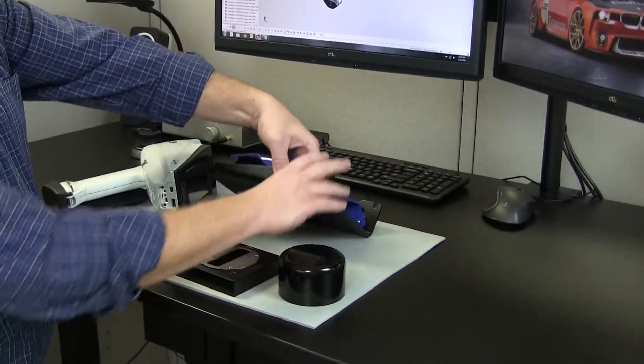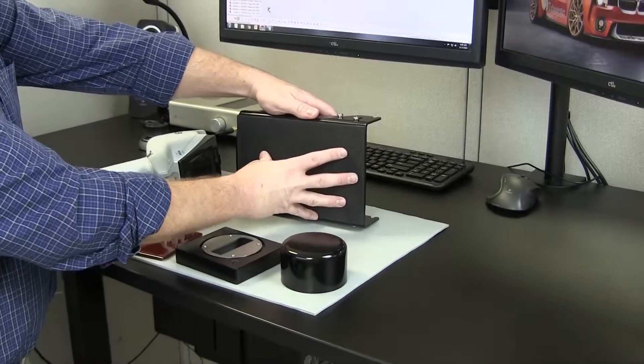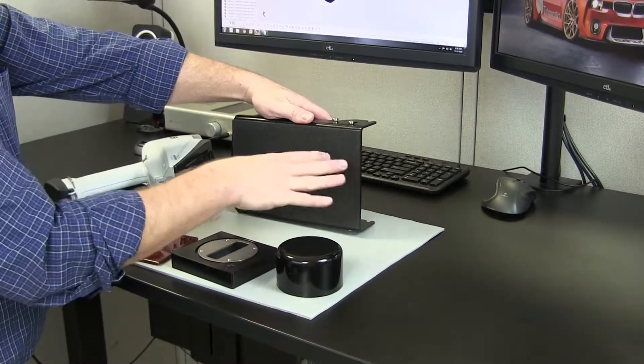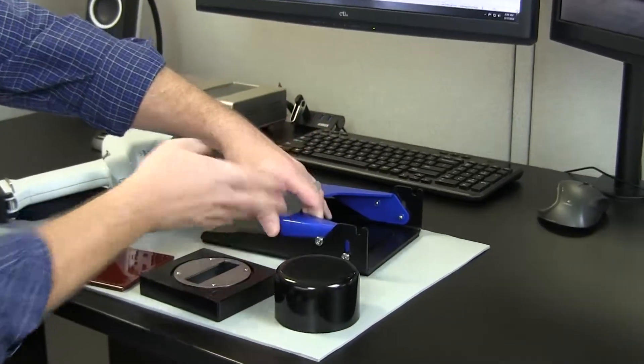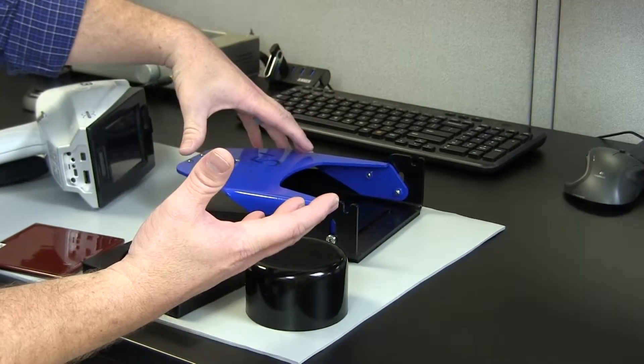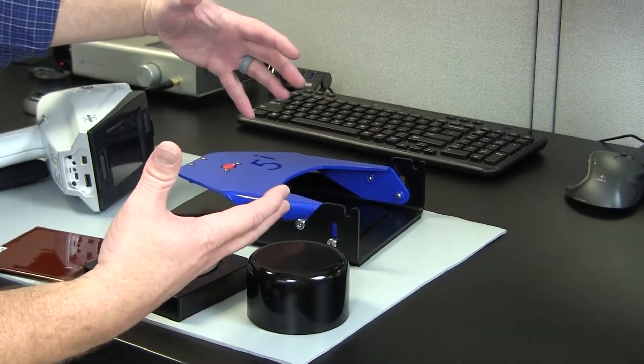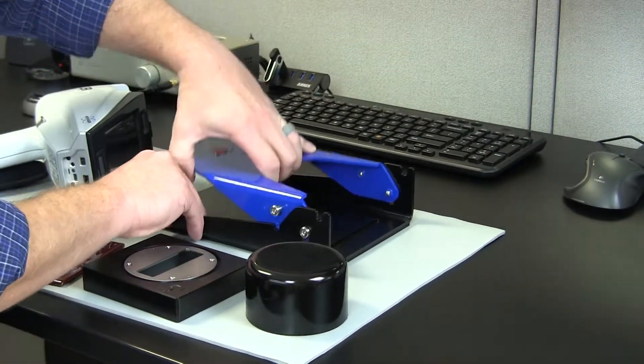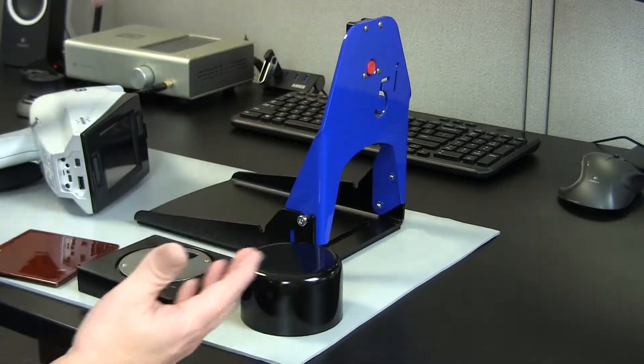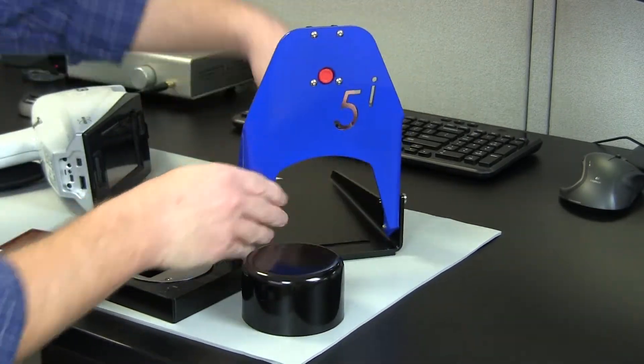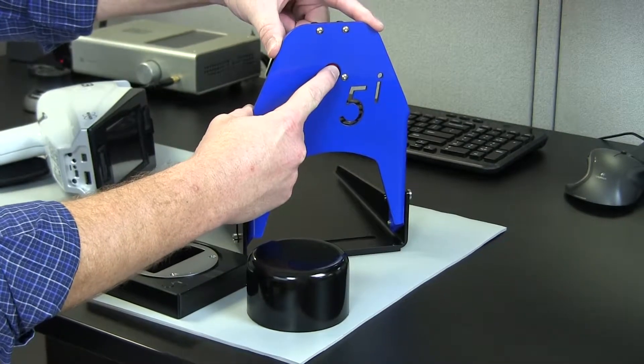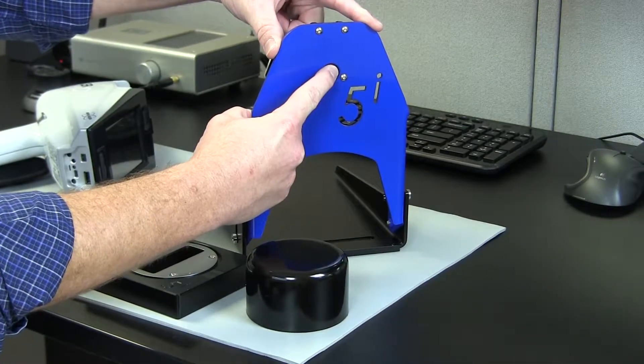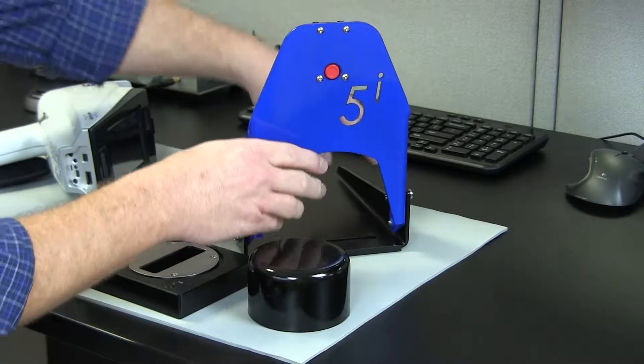It has some grip padding on the bottom for anti-slip in environments where there could be slippery conditions. The stand folds up into its upright position. This button back here is used to install the instrument, release it, and put it in its different positions.